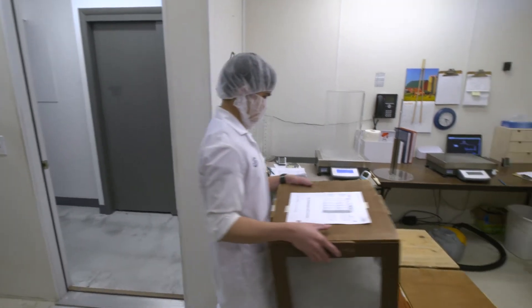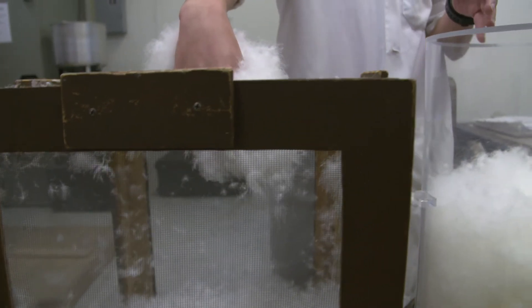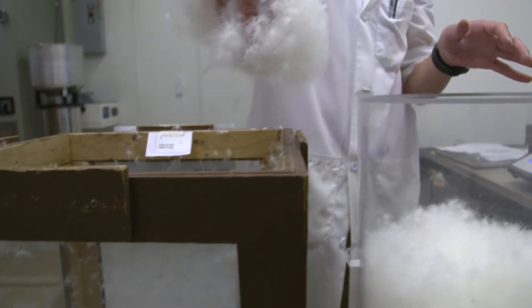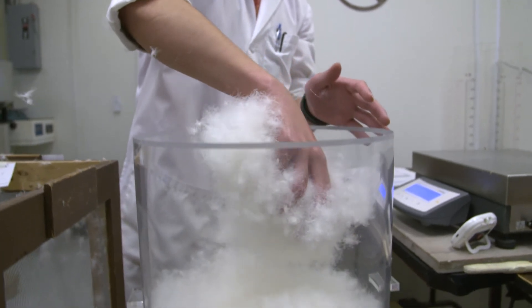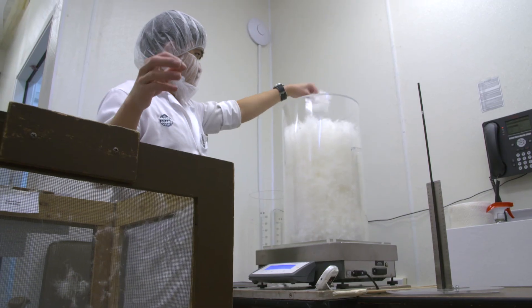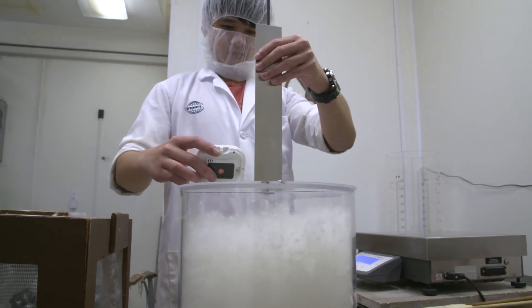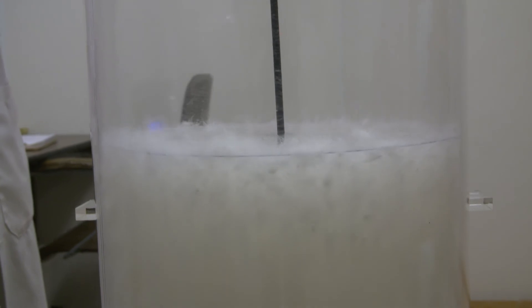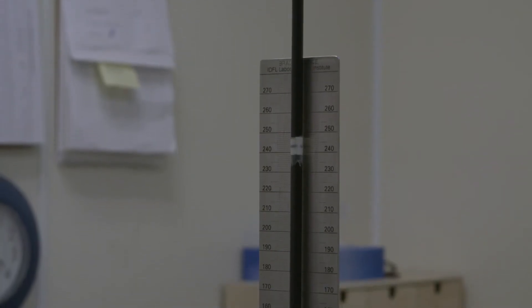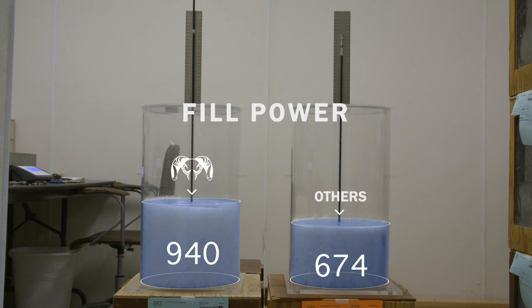We take it to the testing room. We then take 30 grams by hand and place it into a cylinder — a set size used all over the world for fill power testing. Once the 30 grams have been placed, we take a plate that's a specific weight with a rod and let it drop and sink naturally until it stops. Once it stops, we measure the volume, which can then be calculated.